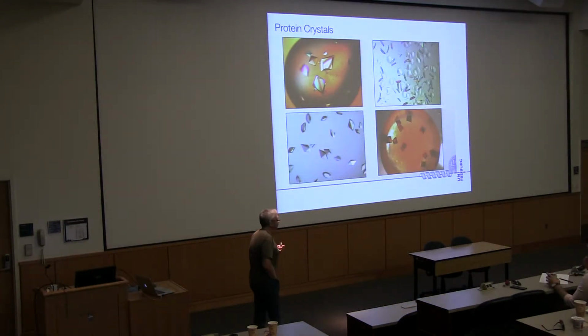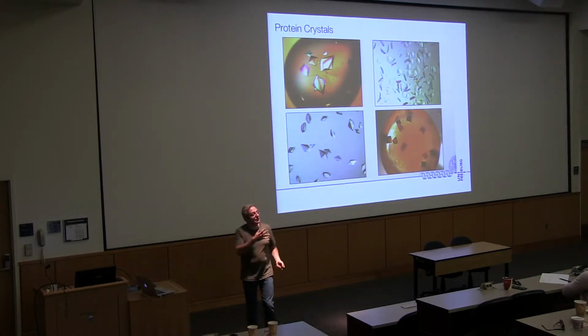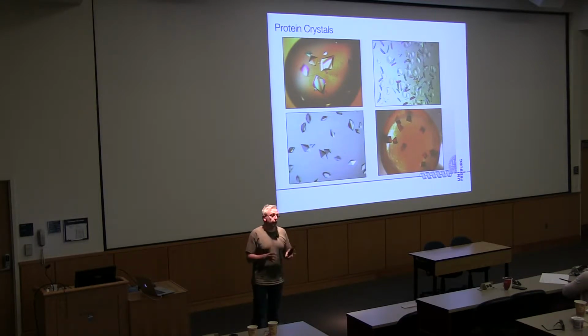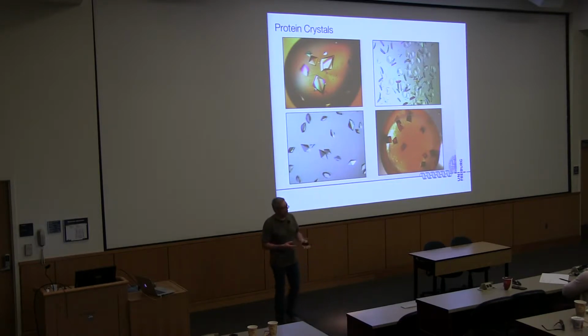Okay. Now, crystallography needs crystals, obviously, and protein crystals, if you never saw any, may not look like what you expect. You have the idea that protein is something large and not very symmetrical. It has some odd shapes. Protein crystals are beautiful, if you ask me. That's kind of a personal opinion, but at least they look like crystals. So they have sharp edges, they have often uniform sizes, they have symmetrical shapes, although the actual molecules that build these crystals can be very, very asymmetric. Now, of course, if you have a cofactor, these are hemoglobin crystals, then the crystals also have the color of that cofactor.